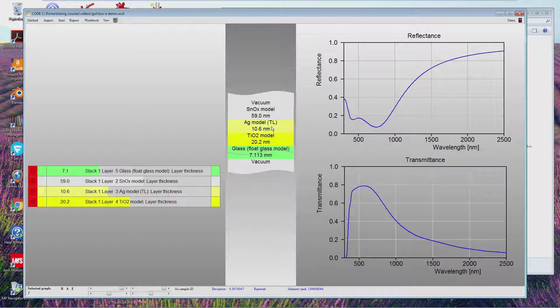There are basically two ways how we can get optical constants of glass and use them for thin film computations. One is using a so-called wizard — a completely automatic routine that takes reflectance and transmittance spectra and computes the optical constants automatically without doing any modeling. That has some advantages but also a disadvantage, which I will point out. Sometimes it's much nicer to set up a real model for optical constants and fit the model parameters, and that is what I will show you in the second part. But first, let's do it the simple way.